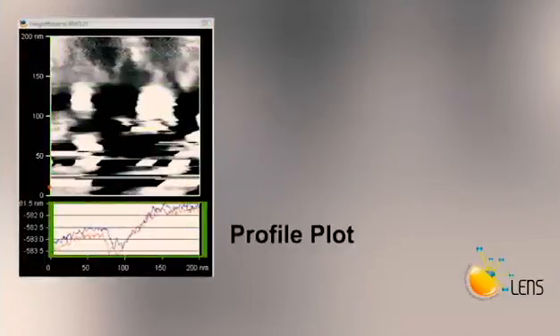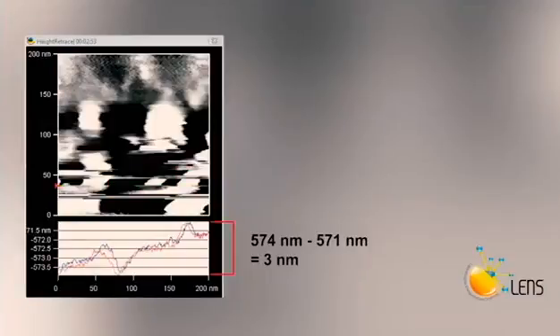Each monitor has the area map, which shows contrast, and the profile plot as well. The height monitor shows you the surface contour and profile of the sample as the tip scans across the surface. For instance, the valley in this plot corresponds to the dark pixels on the contrast map, while the crest on the plot corresponds to the white pixels on the map. There is about 3 nanometers height difference between this area here. The red and blue line in the line plot shows the trace and retrace as the tip moves across the scan along the surface. So as a rule of thumb, these two lines should more or less coincide.